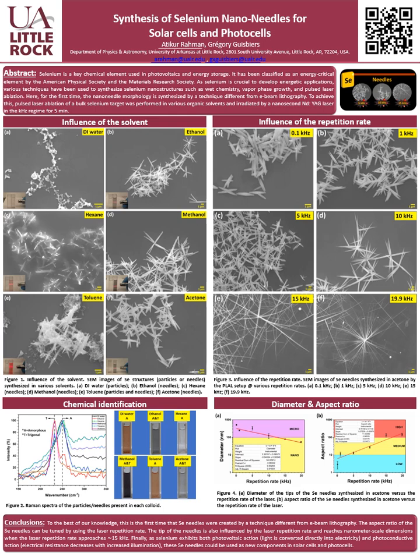Also, you can see the color of those nanoneedles: this one is pink, and the others are gray. The pink ones are the amorphous phase, and the gray ones turned into the trigonal phase nanoneedles.